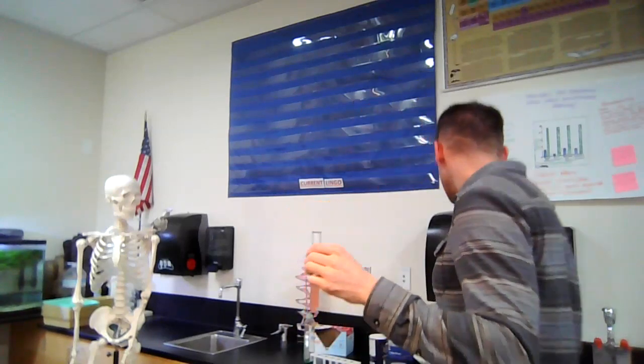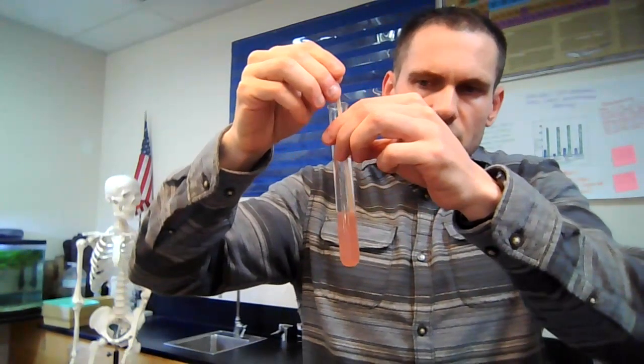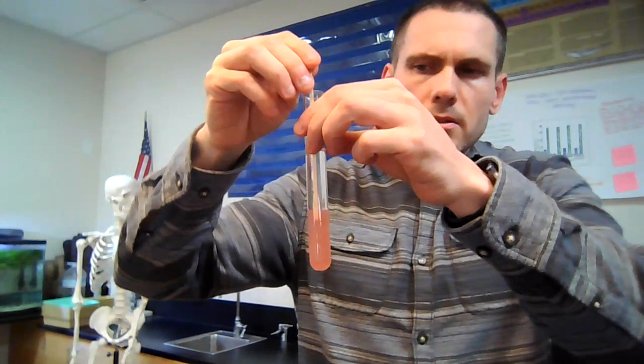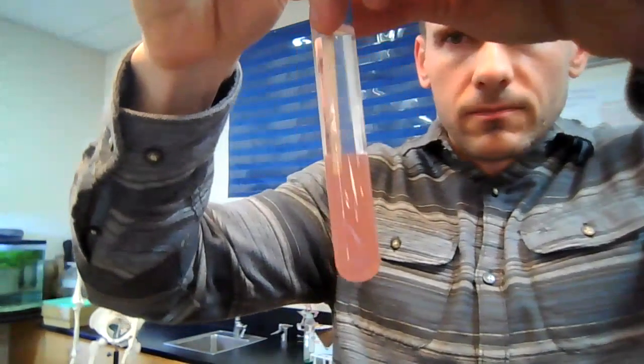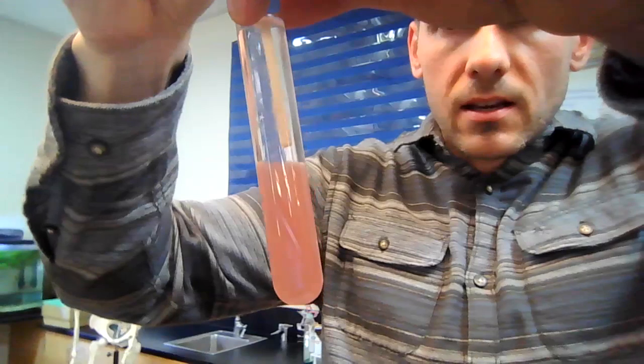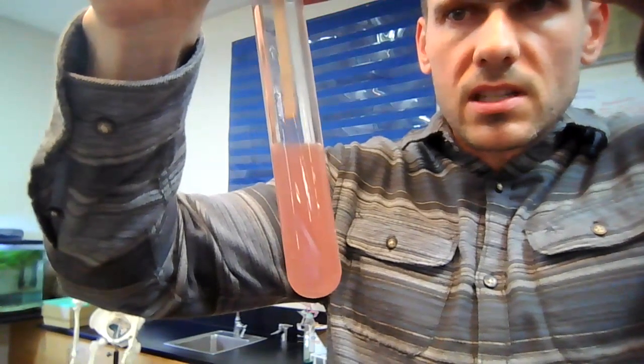So you're going to take a little stick, a little coffee stir, and very gently put it down into the test tube and gently stir it right where the 2 layers meet. If you look super carefully, you might see something sticking to the stick.